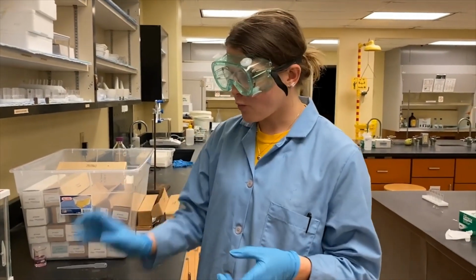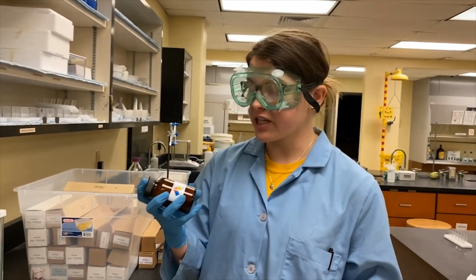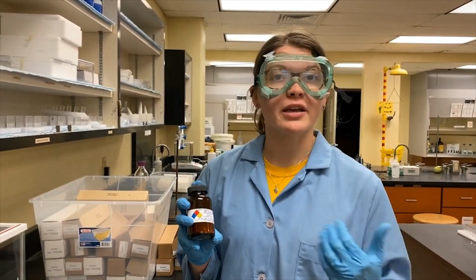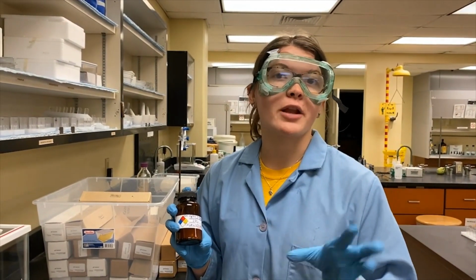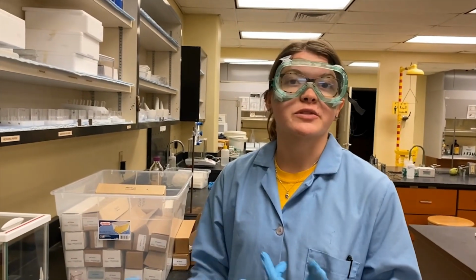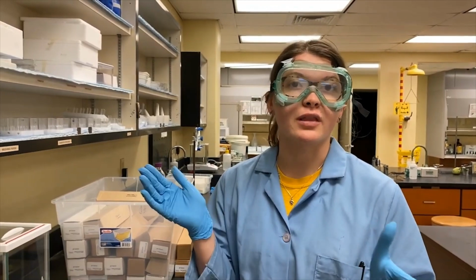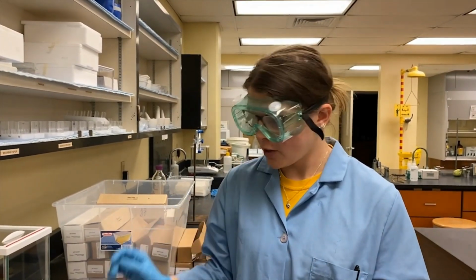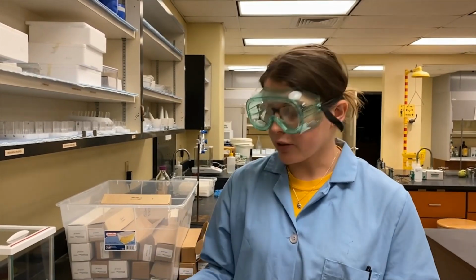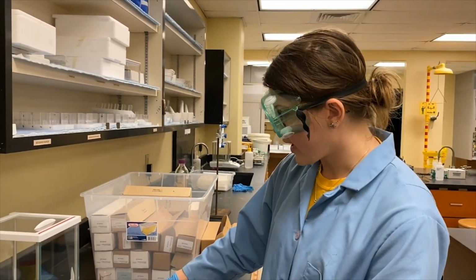Okay, so we're going to start by weighing out the DPD that we have. The DPD is essentially an indicator, because as you saw with the blank, the absorbance of the blank read about 0 absorbance units. The reason that happened is because it was a clear, colorless solution, so there was no colored light for the light of the machine to bounce off of. What I'm going to show you right now is how the color changes when we add DPD.